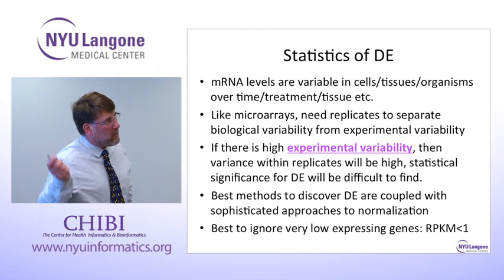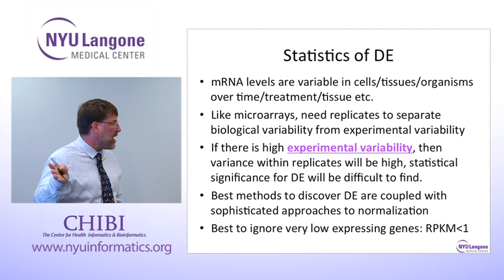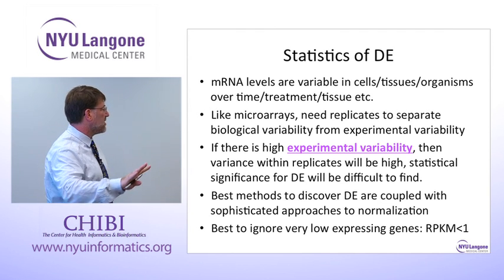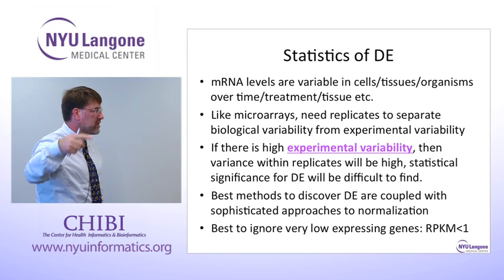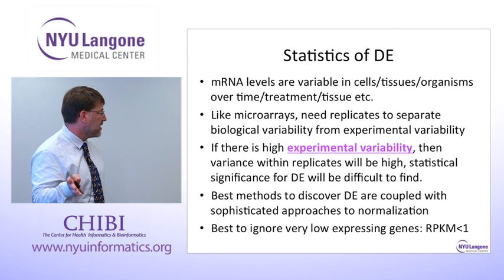Well, what we see is good correlations between the two. I can say that, regardless of the details of your statistical methods, even if you just do the simplest, the RPKM and the t-test with multiple test correction, you're going to get good correlation between microarray and RNA-seq.